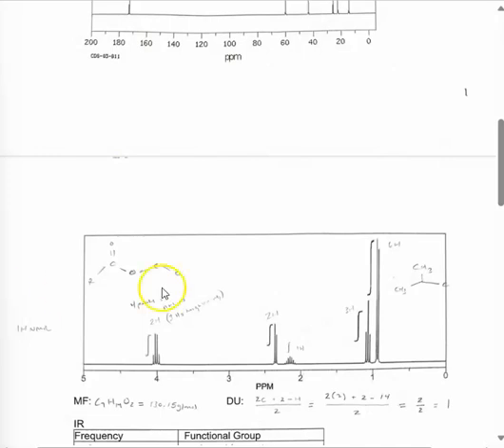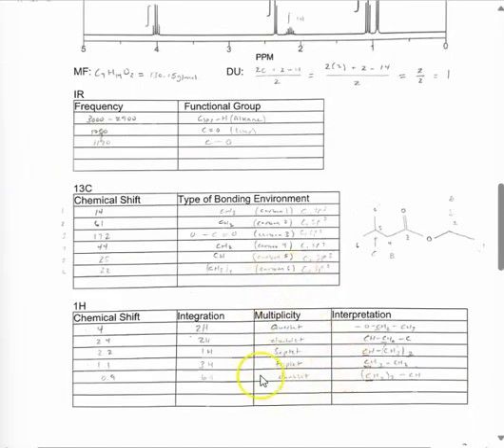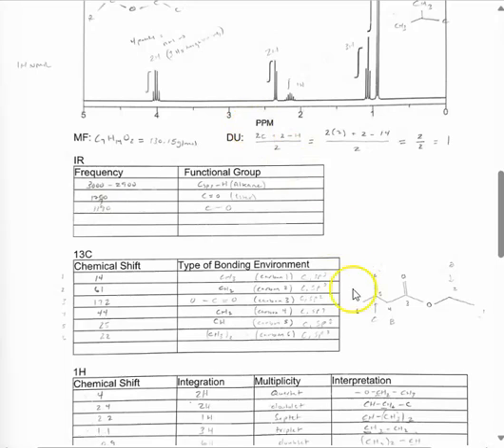Next we'll look at the H NMR, and I'll scroll up to this data here and use these as my reference point. Here we see about 5 different spectrum spikes, which are labeled under the multiplicity column that we see down here in this table. The first spike is at the 4 marker, and we have a quartet. The next one will be at the 2.4 marker, which is a doublet.